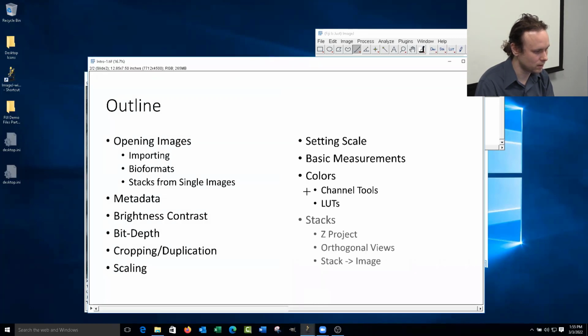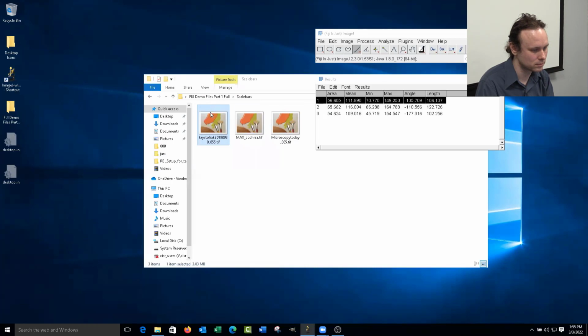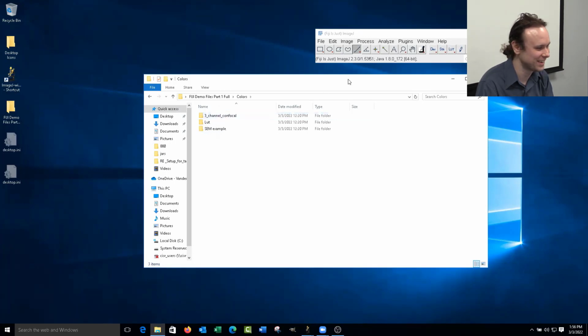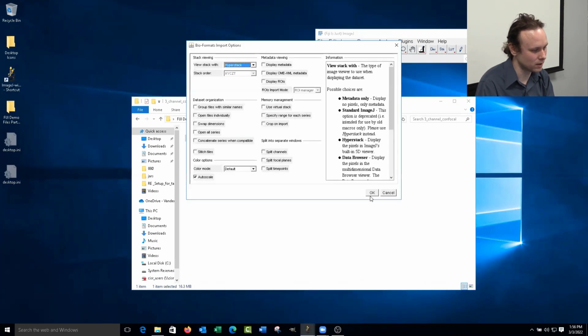Okay, let's see. Now we're on colors. Colors are kind of fun. So Evan, let me just jump in and say we've got 5 minutes. Do you want to do that? I didn't know time flies. Yeah, or do you want to go ahead and open up for questions at the end? Let's fly through colors. We'll probably revisit it on the next one. Okay. And go ahead and start putting your questions in the chat, and I'll do them when we get done with this section.